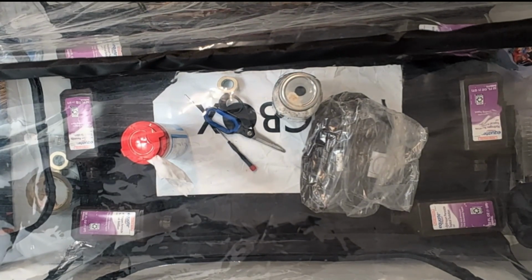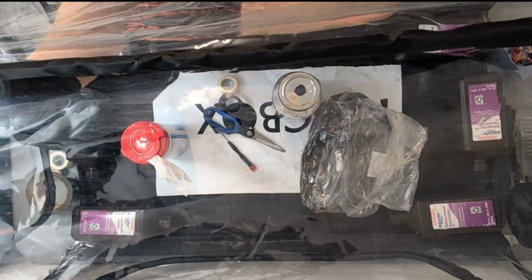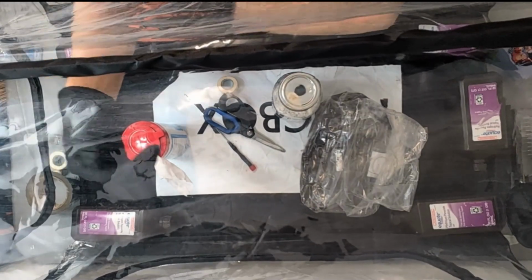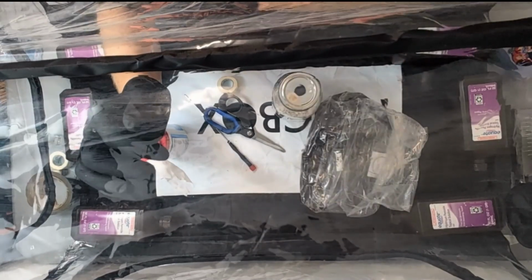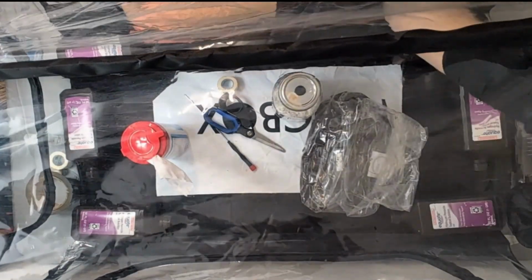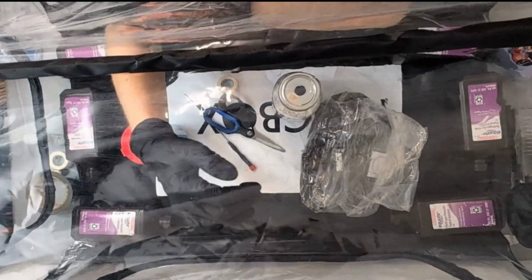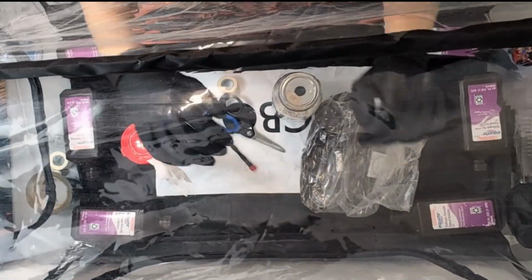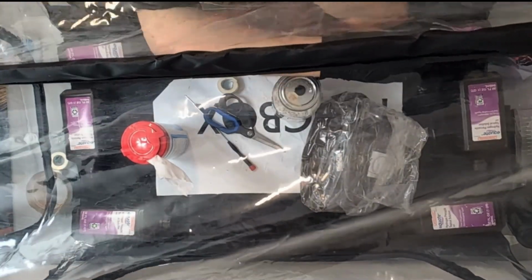This hand sanitizer smells like Jägermeister. I've gone through a lot of hand sanitizer, and this is the first bottle that smells like a liquor. I like to go up to my elbows. It's just a good standard to go by for myself. I want to make sure none of the fabric from my shirt is getting in, and I'm also trying to make sure that there aren't any large gaps in the armholes. There we go. Just trying to get my hands on this to tighten it.